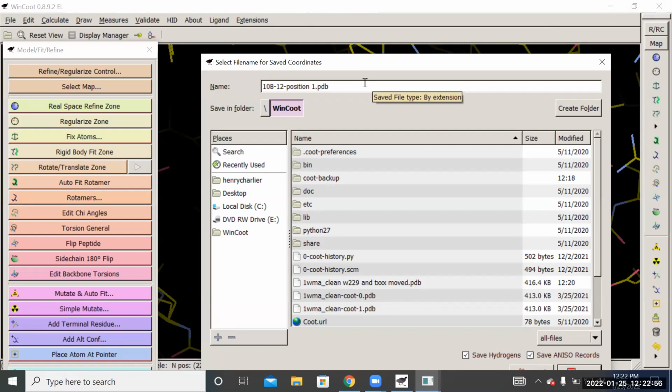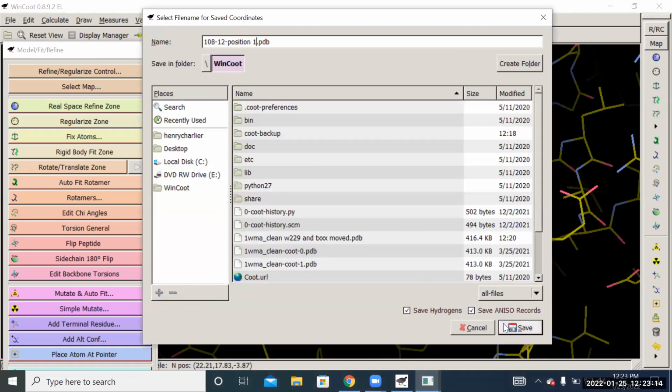so that you know, okay, this one goes with the protein where I had to move the certain side chains, and that way you explain in your notebook which one of these goes with the corresponding protein. And that turns out to be really important, because if you don't do that, it's not going to be easy to find out how to use your work.